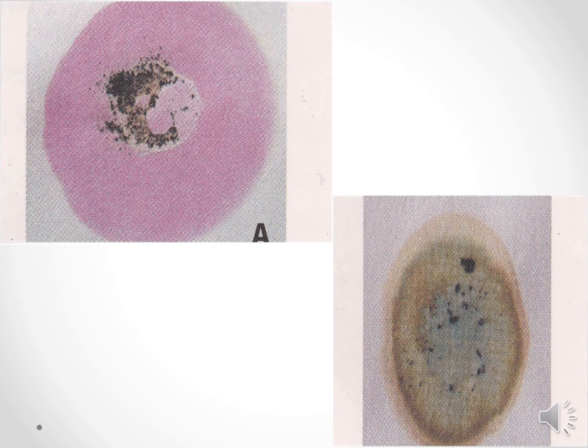Again, what is this? Positive Takayama test. What is this? Positive Teichmann test. Above is positive phenolphthalein. The stain may be blood. Below, positive guaiacum test. The stain may be blood.